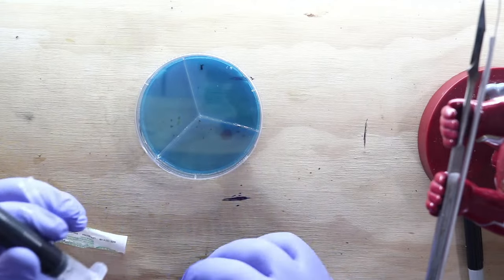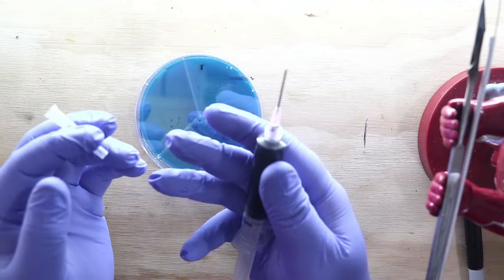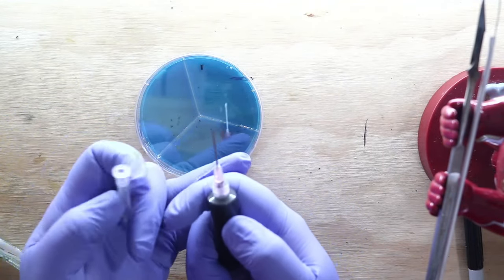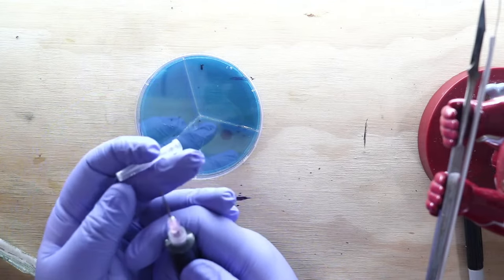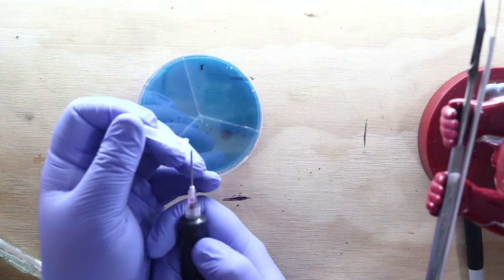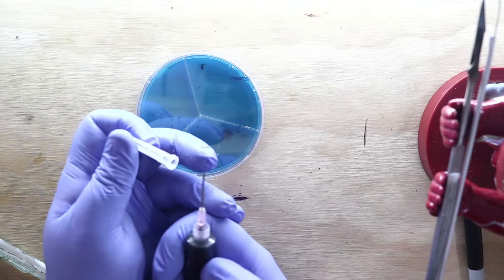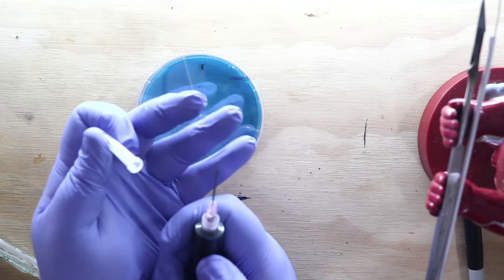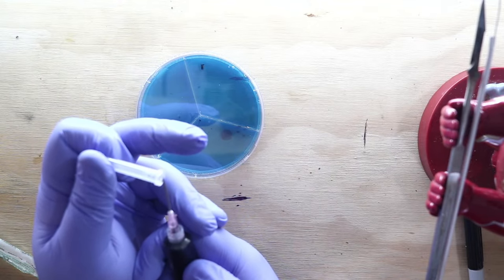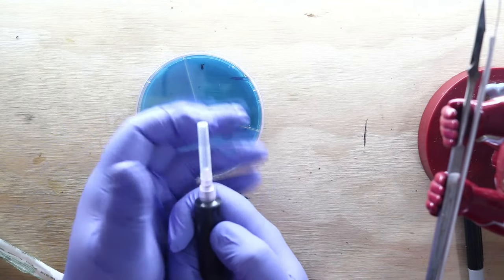Now, let me show you what I should have shown you a second ago. This is called the pistol grip. So you take this syringe and your needle and you hold it like this. You take these two fingers and you wrap them down right here. And this holds everything on, and then you scoop. Take the needle cap and scoop it on to the needle and close it.